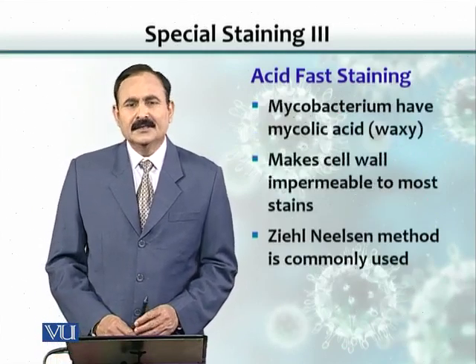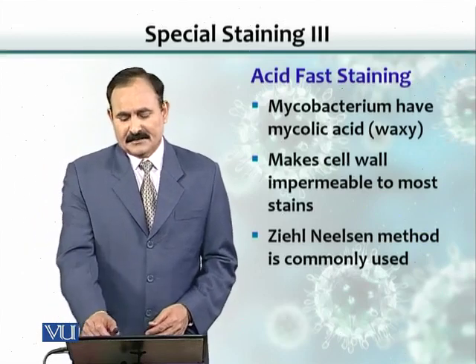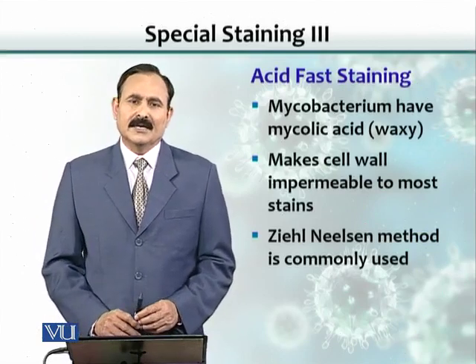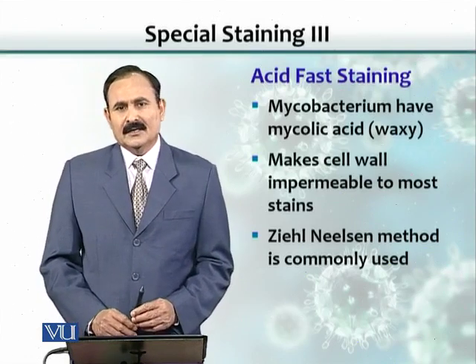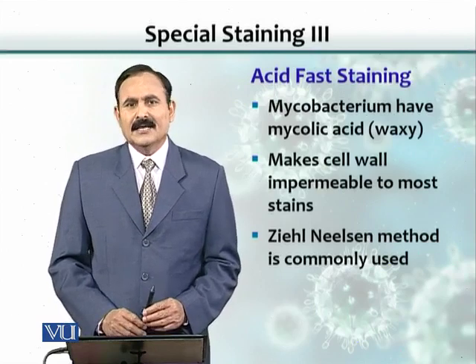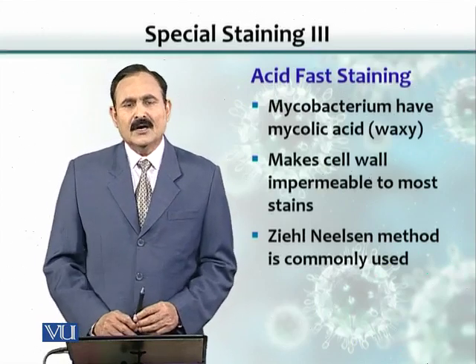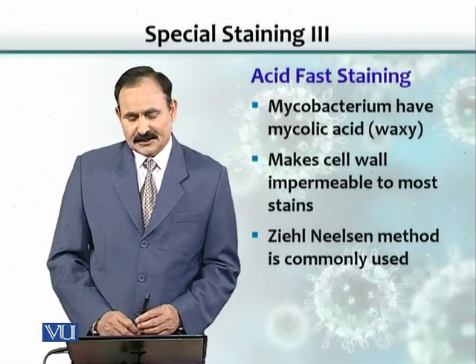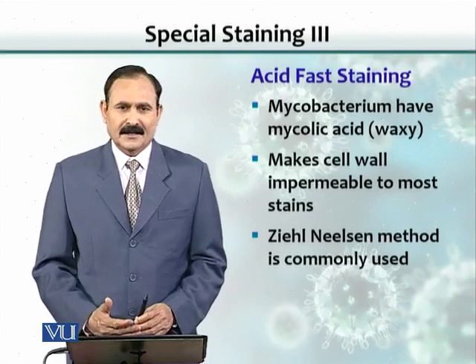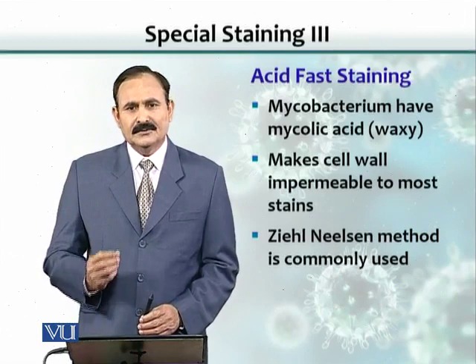In this procedure, the background is that Mycobacterium has in its cell wall a waxy material called mycolic acid. This makes the cell wall impermeable to most stains. And the trick is, again, we need to heat the stain in order to get through the cell wall.